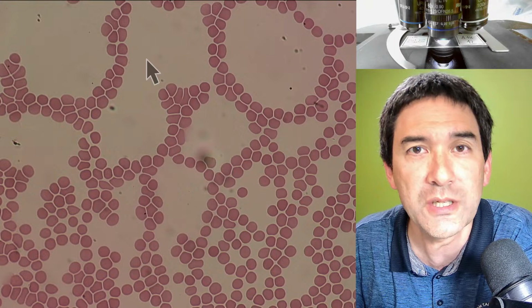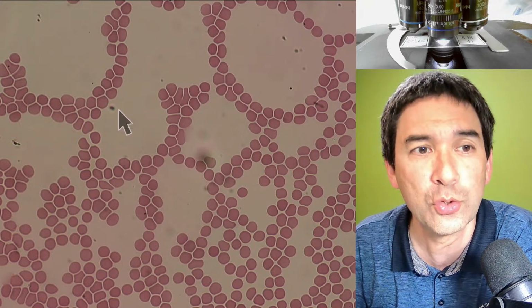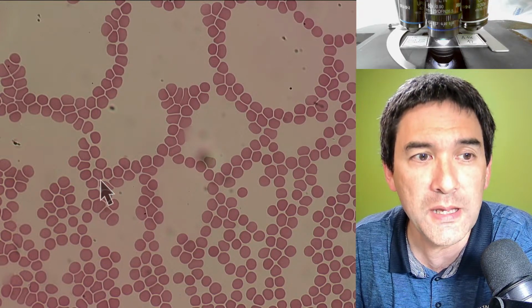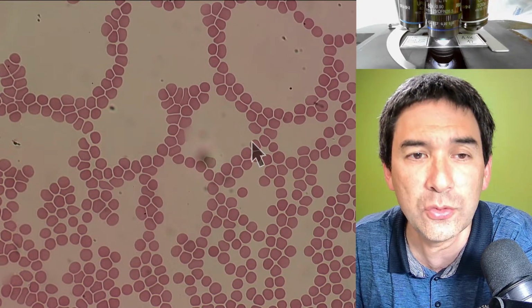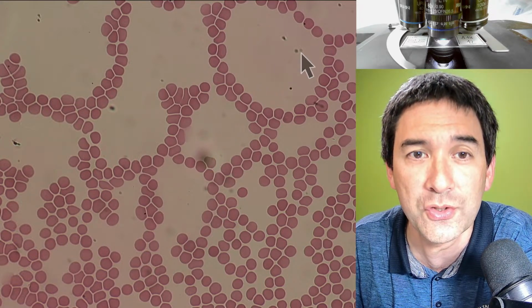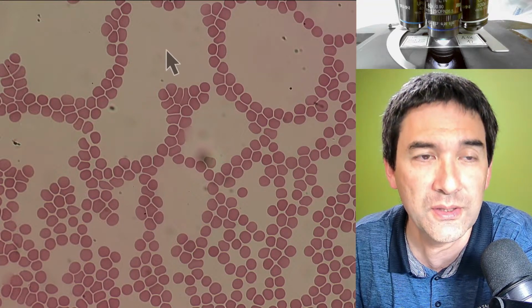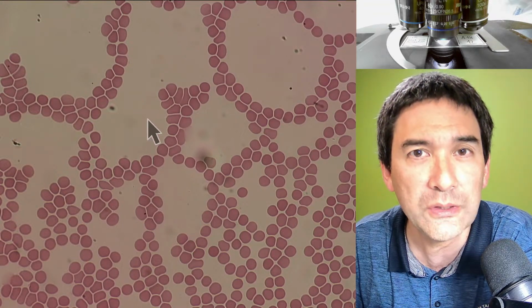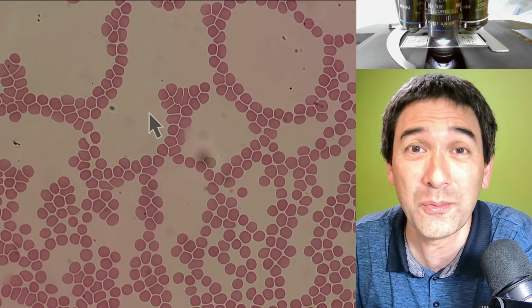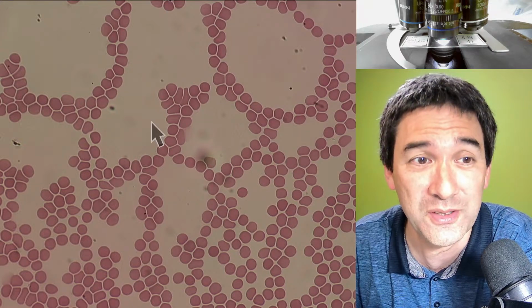And this is also something that happens during the drying process as the blood plasma starts to dry up and the liquid starts to retract. Basically the blood cells start to stick together like this, and then you have those places where there are these empty patterns in here, and we're not going to see those in a fresh blood sample. This is something that you can see not only when you dry blood, but also, for example, last week when I dried some yeast cells, you could see the same phenomenon.